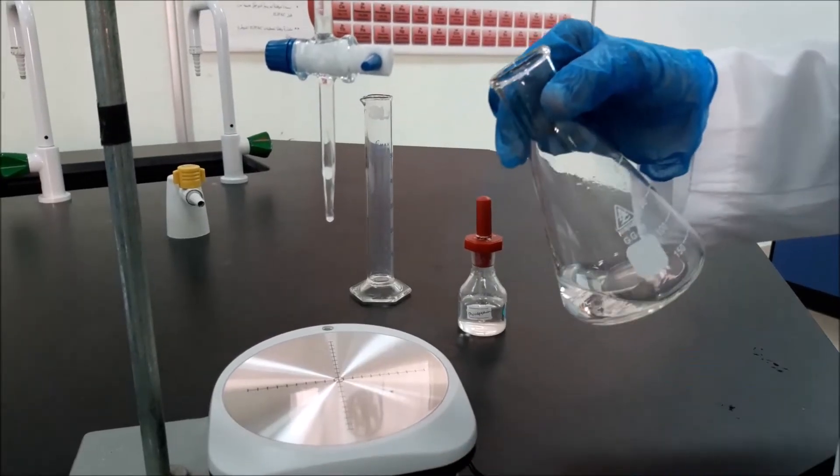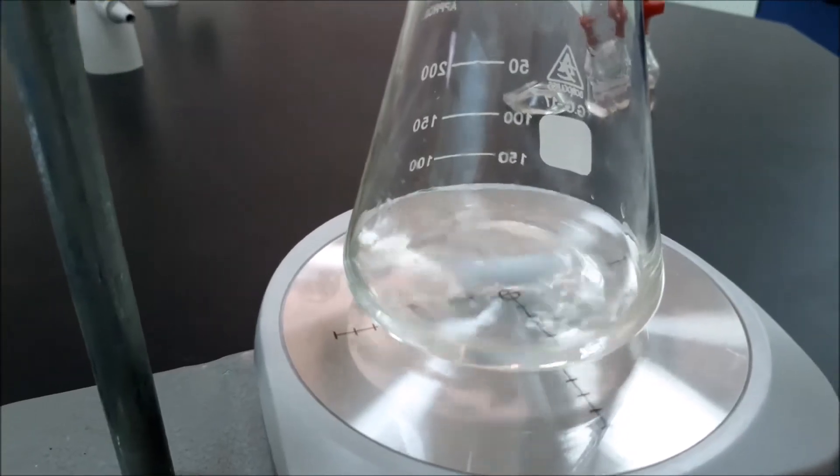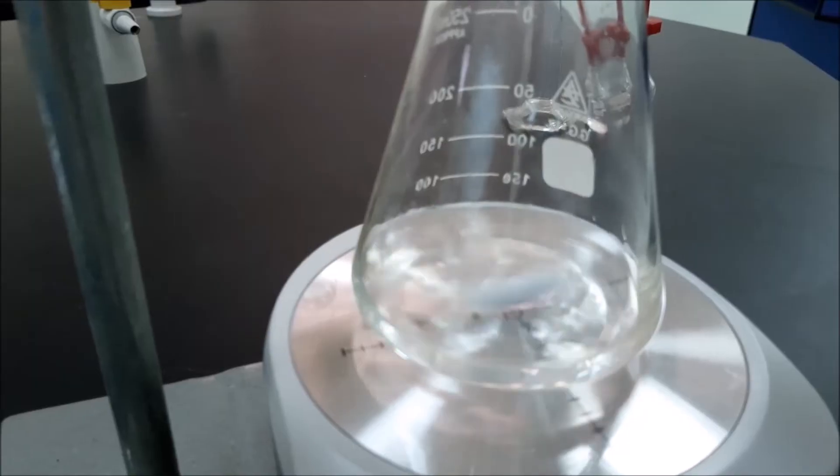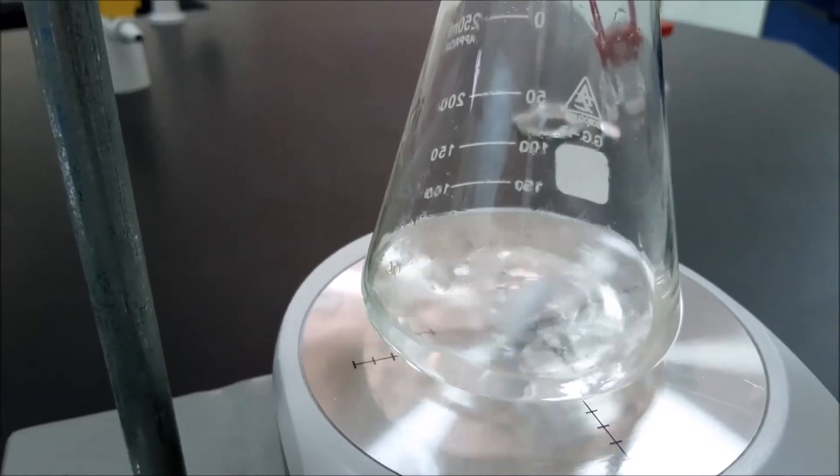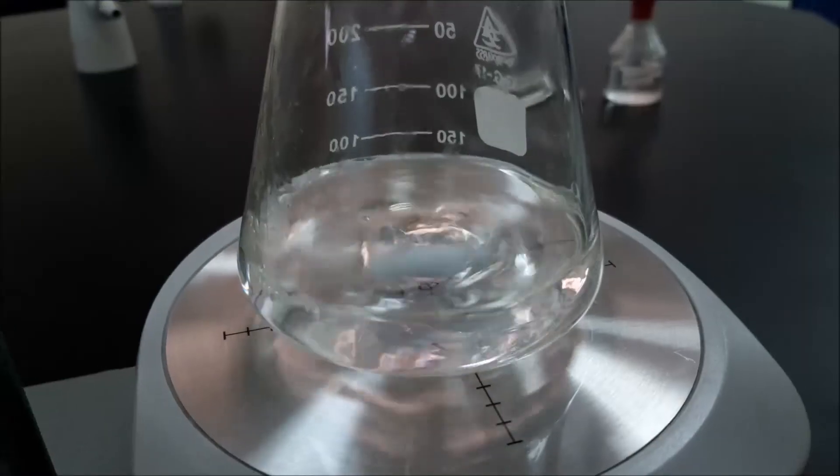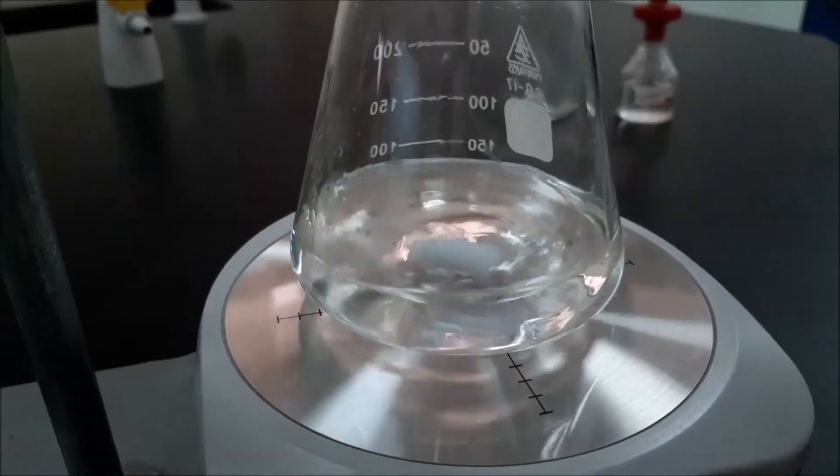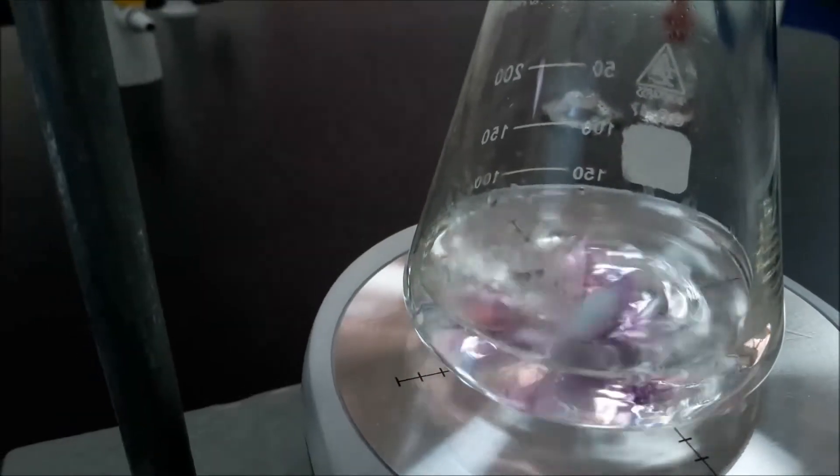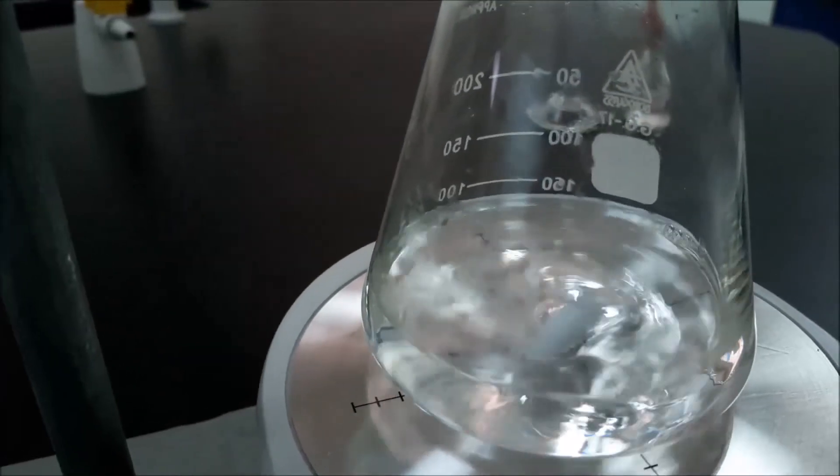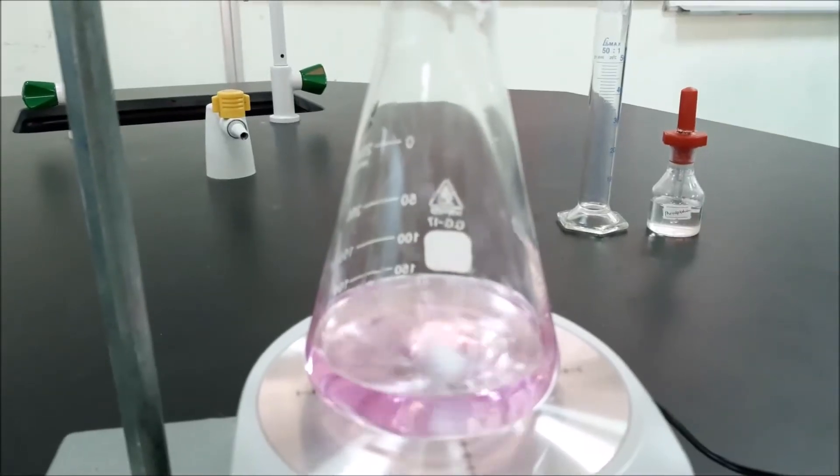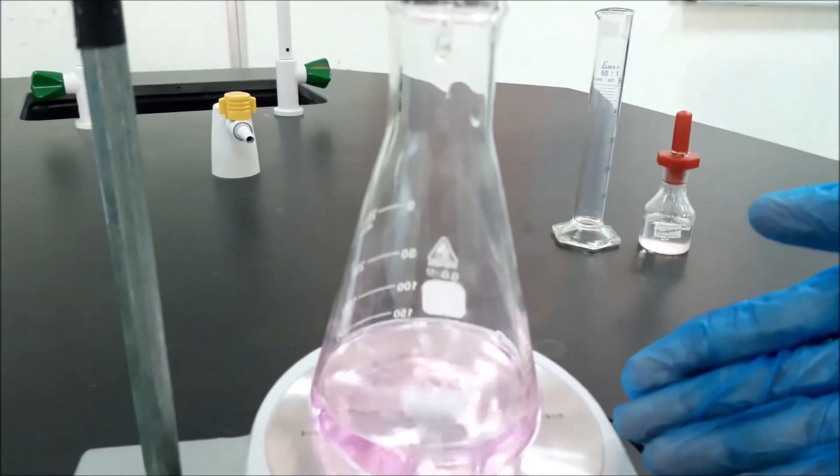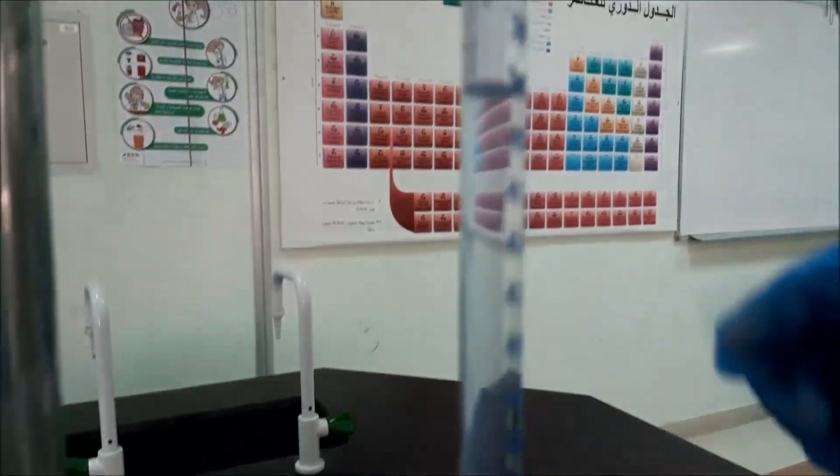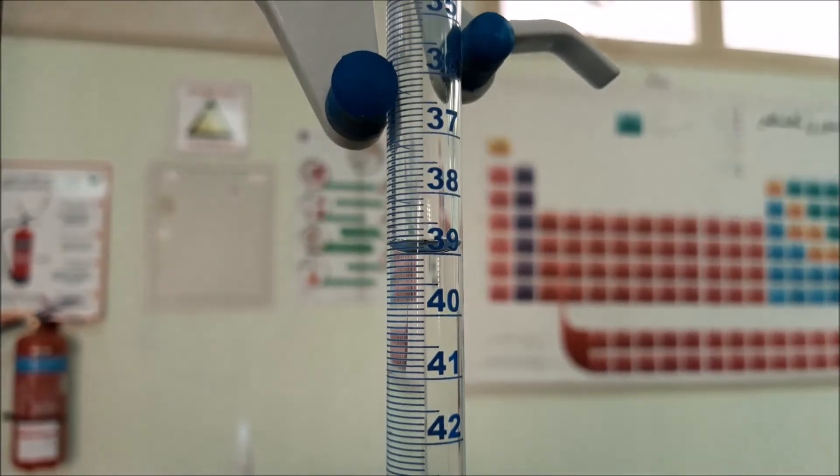And start the experiment. We will turn on the stirrer and drop the NaOH until it changes color. Now, it changes color. The final reading of the burette is 39 ml.